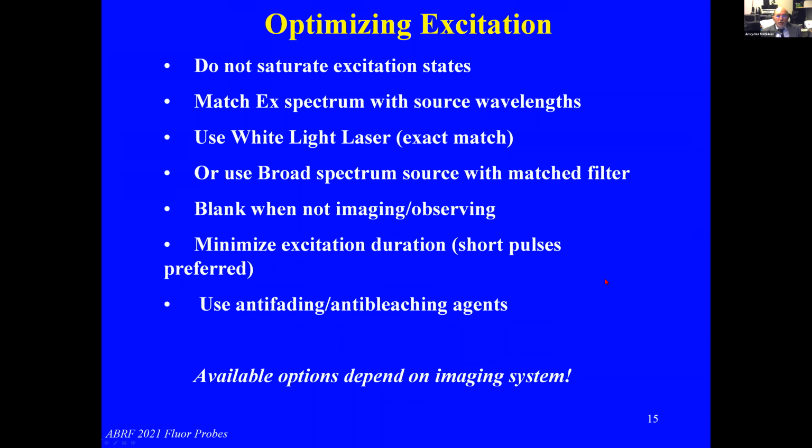Now, briefly, if we look at the optics of the probe application, when optimizing excitation, we should look into not saturating excitation states, matching emission excitation spectrum with source wavelength. Preferentially use white light laser, where we can continuously adjust excitation wavelengths and have exact match. Or as alternative, use broad spectrum source with a matched filter.